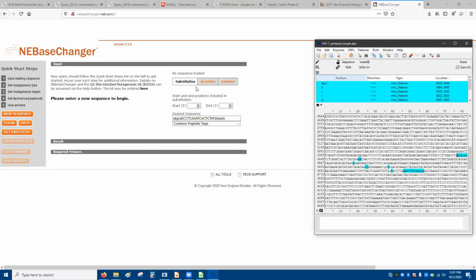We can save doing two steps by just doing one insertion. It's effectively just going to put the same thing there that we already have for most of that sequence, but because it's short enough, we can just do the one insertion. That'll save us a step.